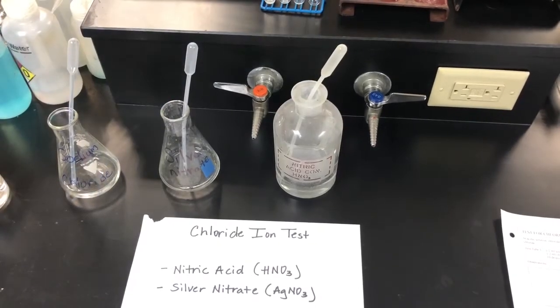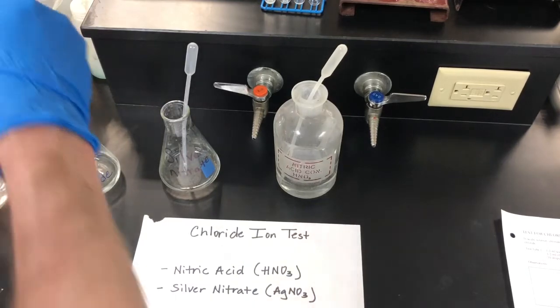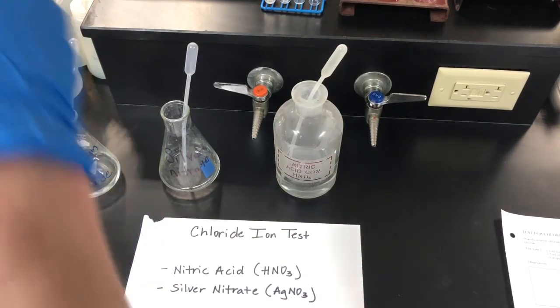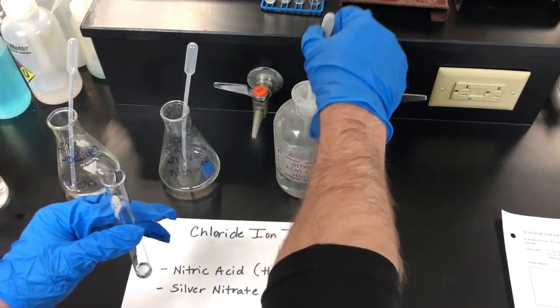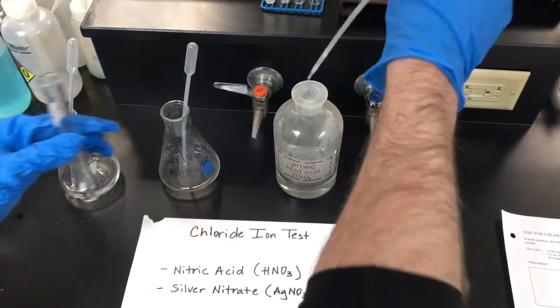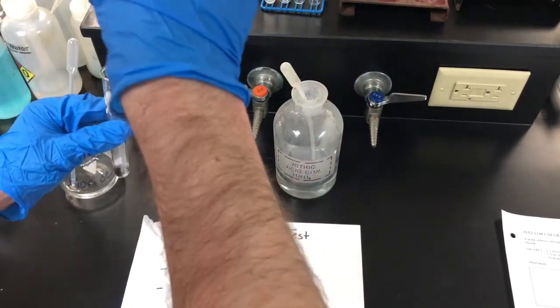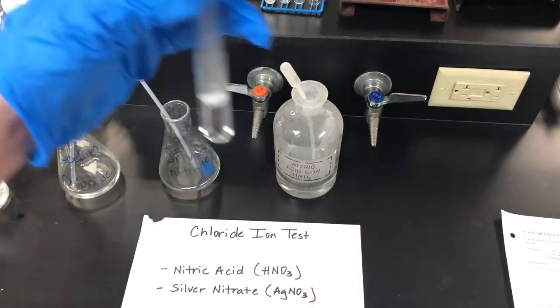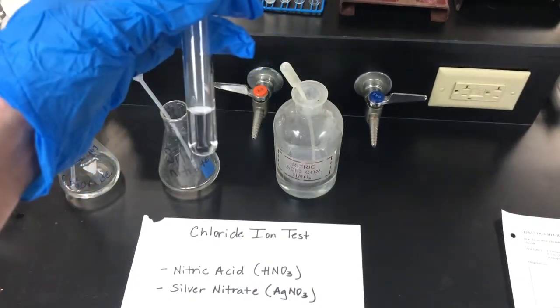Okay, so we're going to be using our unknown, number 24, to determine if it's positive for the chloride ion. So what we're going to do is we're going to take 1 to 2 milliliters of the unknown solution. So we're going to put a nice squirt. And then we're going to put 1 to 2 milliliters of nitric acid. Squirt. And then we're going to put some silver nitrate. Okay, so it doesn't appear that a precipitate was formed, so we're going to say that this one is negative for the chloride ion.